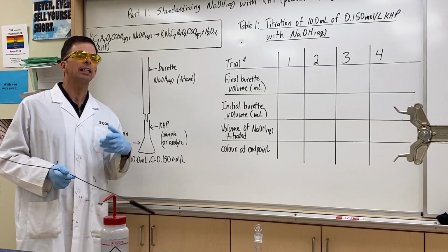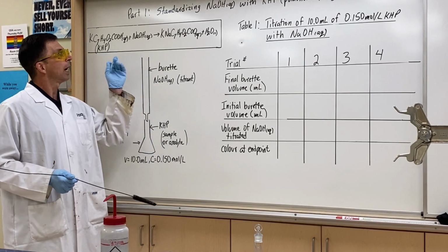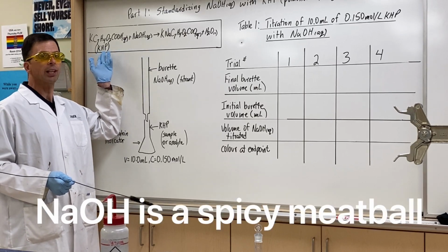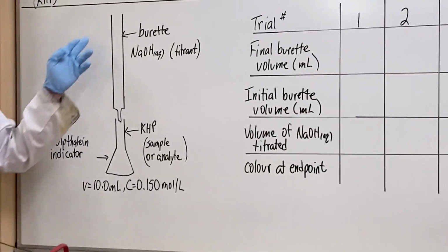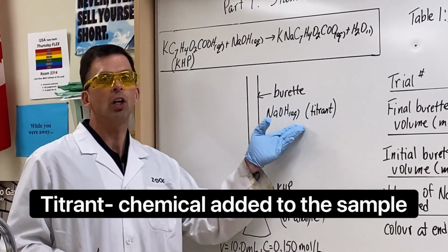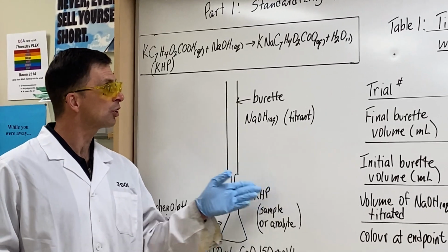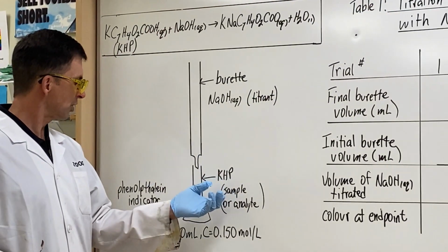In order to do that, the first part of the two-step process is to determine the amount concentration of our sodium hydroxide when reacted with our primary standard, which is KHP. You can see they're in a 1-to-1 mole ratio. In the burette will be our sodium hydroxide, that's called our titrant. In the flask, our sample or analyte, that's called KHP, which is potassium hydrogen phthalate, the abbreviation for that.